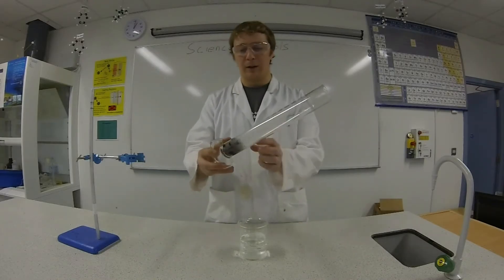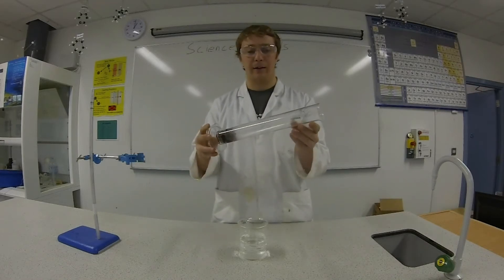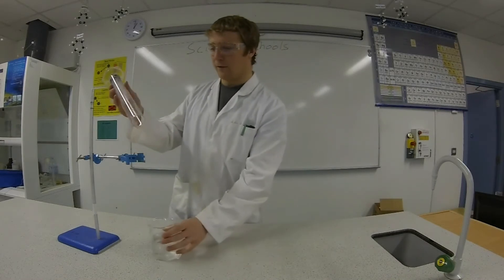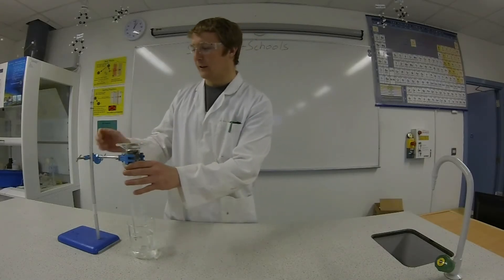So we're going to push the iron wool inside the graduated cylinder, shove it right down to the end like that. Then invert the graduated cylinder into the water and clamp it tight.